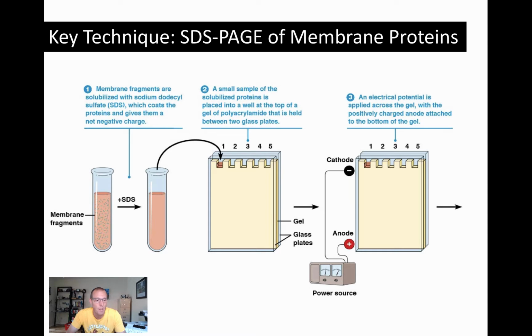It's not such a nice chemical. When people used to work with this and didn't realize it was a neurotoxin, their fingertips went numb over years after working with this compound, so you have to be careful with it in its powdered form. Once it's polymerized, it's perfectly safe.